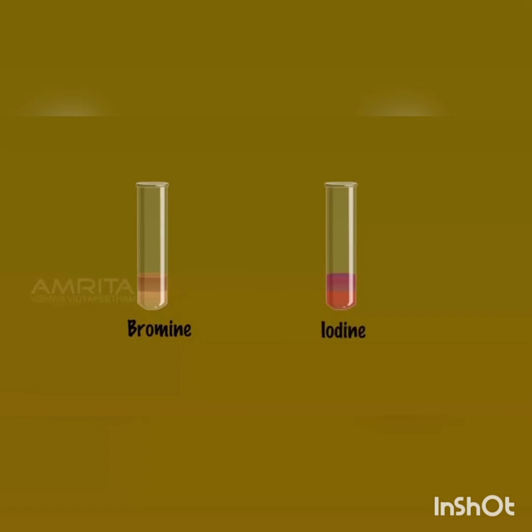When sodium iodide formed in the Lassaigne's extract is treated with chlorine water, the iodide is oxidized to iodine. Iodine dissolves in carbon disulfide and imparts a violet color in the carbon disulfide layer.